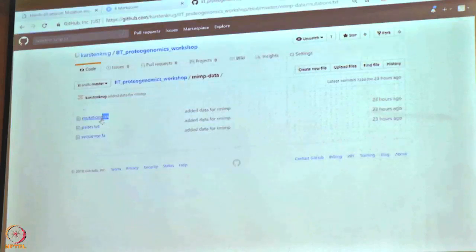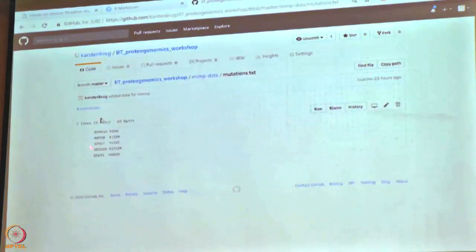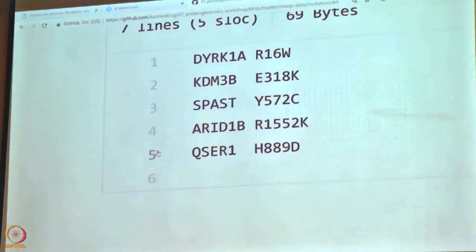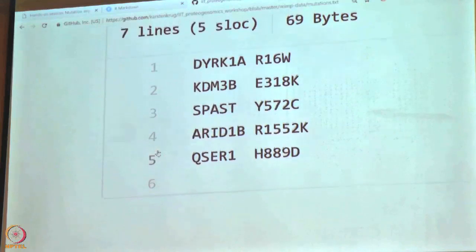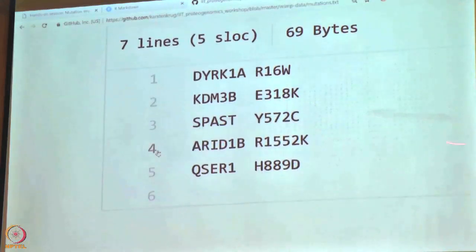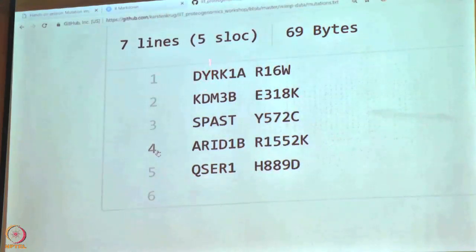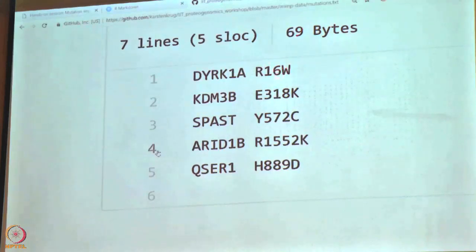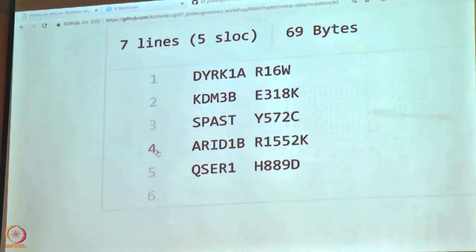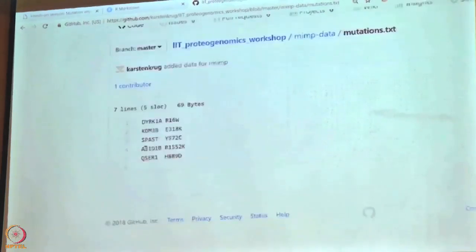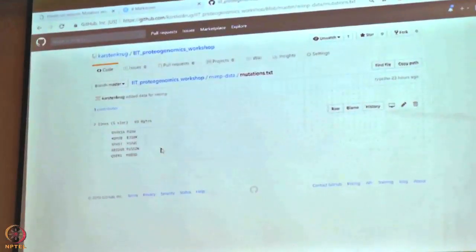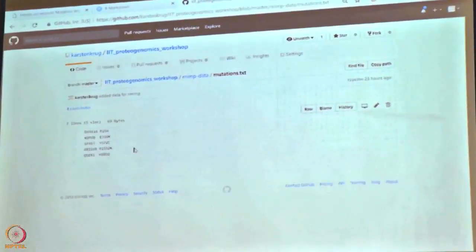This is very specific to the MIMP software we are using here. The mutation file is divided into two columns: the first column is the gene name, and the second column is the substitution that the mutation causes. Simple as that. This link will also be available after the workshop, so you can always come back to it.